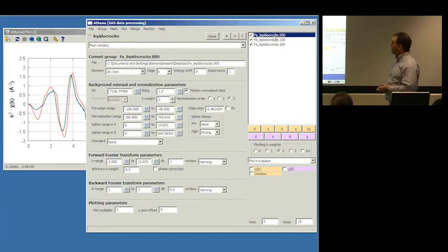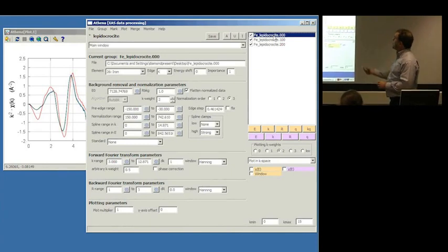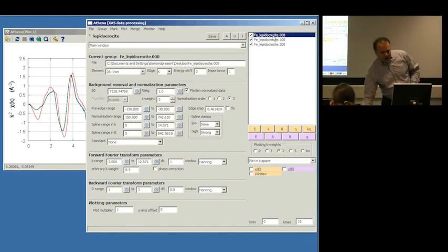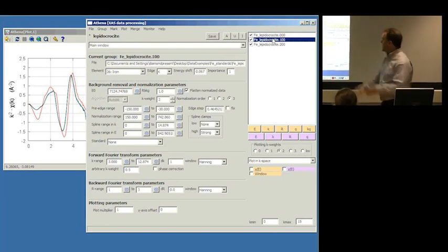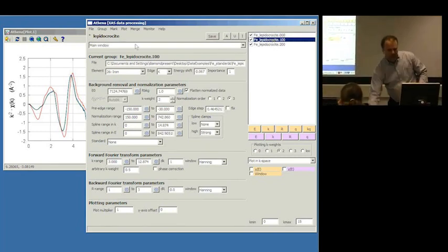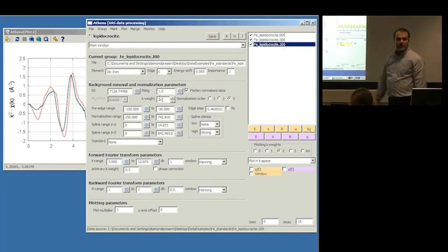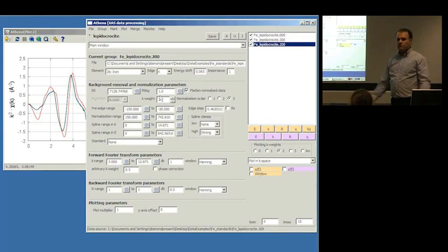Well, the tedious, boring way of doing that would be to note that it's 7128.74769. That's a lot of numbers to remember. And click on each one and say, okay, now I need to type that number. I need to do this and type that number in there and then go to the next one. And, if you had a list of 20 scans, you'd be pretty unhappy by the end of doing that.